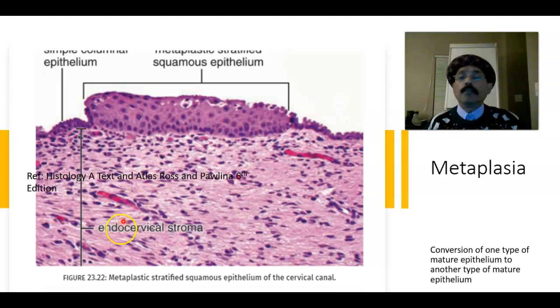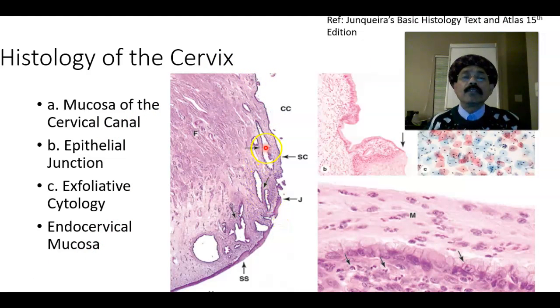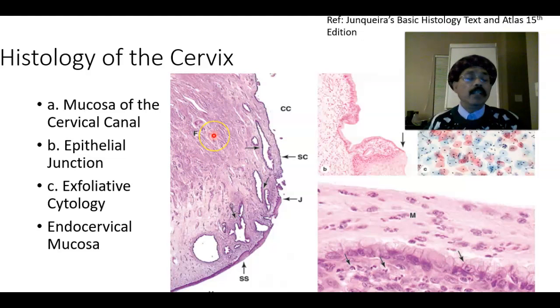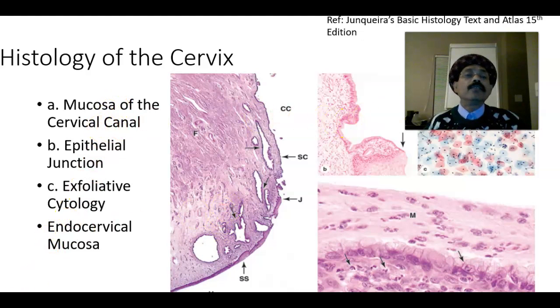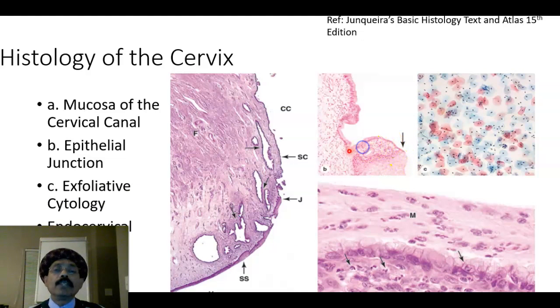The nerve supply is autonomic, not somatic, in the cervical region. The mucosa of the cervical canal is lined by columnar epithelium; the cervical glands are branched tubular glands, obliquely placed. The lamina propria for the glands is composed of fibrous tissue, collagen and elastic fiber with few muscle fibers. Cyst formation may occur in the glands. Here we can see the epithelial junction — stratified squamous epithelium on one side and columnar epithelium on the other; the columnar is single-layered while the squamous is multi-layered.